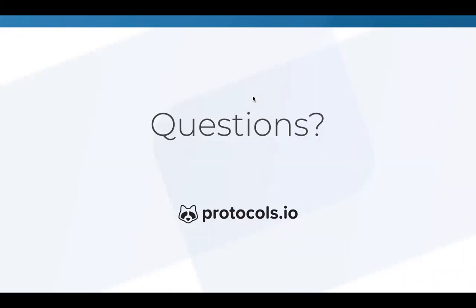Good. My question is, this is a nice way to get protocols into an electronic form, protocols that you usually tend to keep on paper and which are not always easy to work with and share. One of the questions I have is, is it possible to use this platform for integrating this protocol into a laboratory manager system?